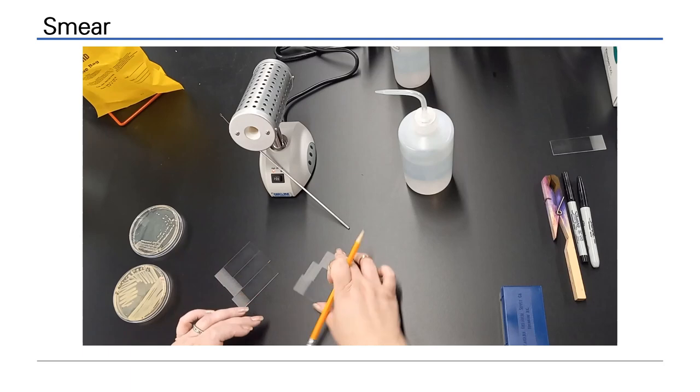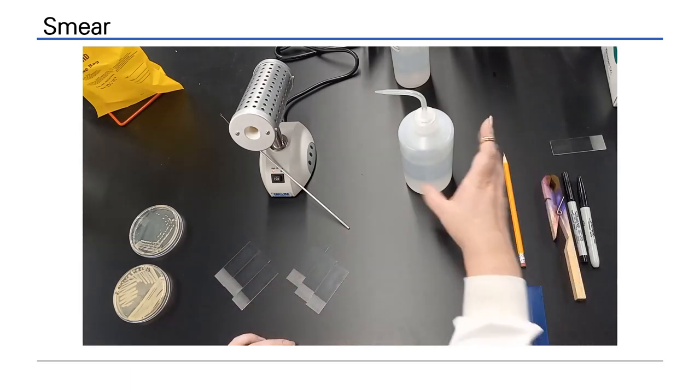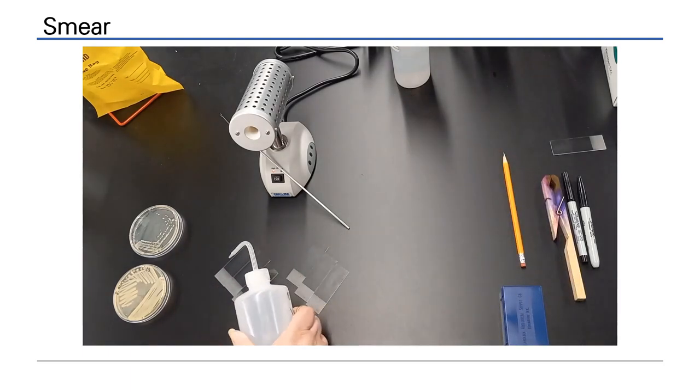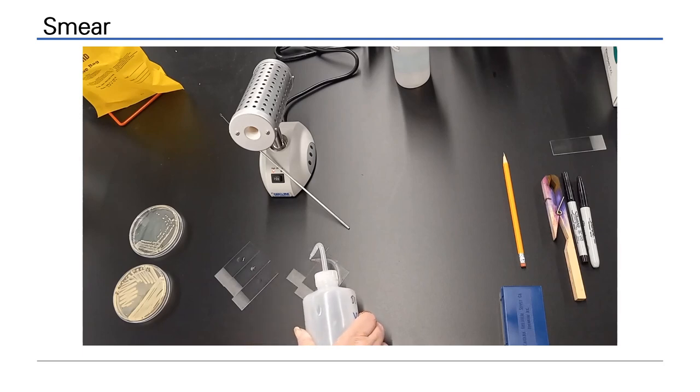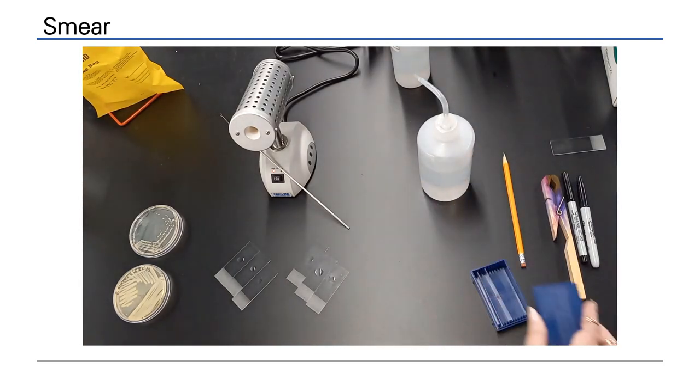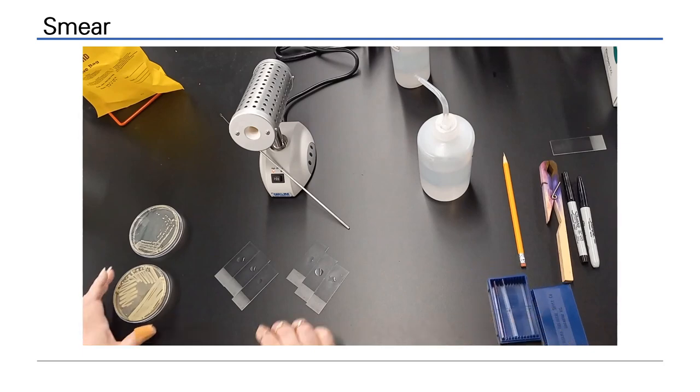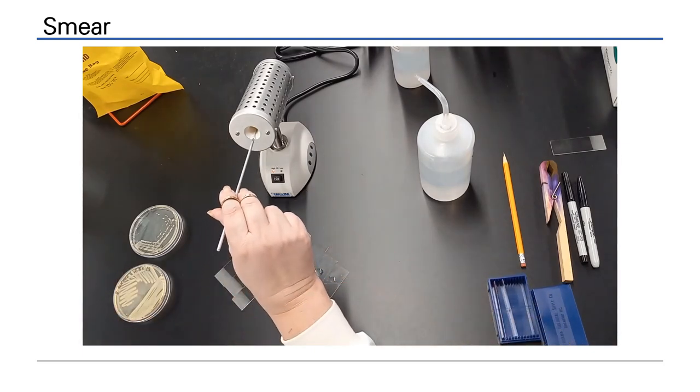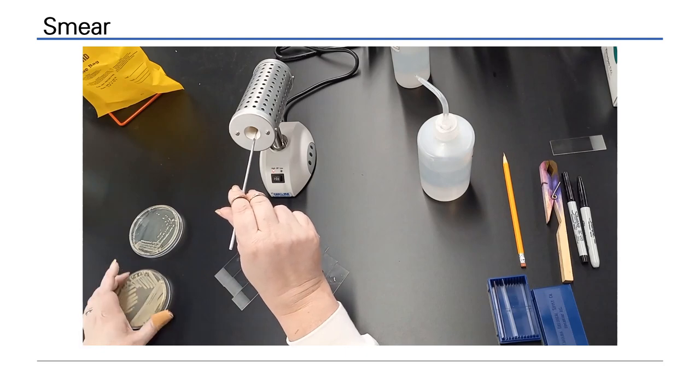A smear is a technique used to inoculate a microscope slide with a monolayer of cells from your specimen. We start with clean labeled slides. Apply a small drop of distilled water to the center of each slide. It is usual to make multiple smears from the same specimen at the same time. This is the most efficient way as moving downstream you will want to stain multiple slides at once.